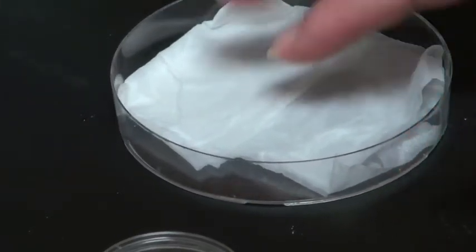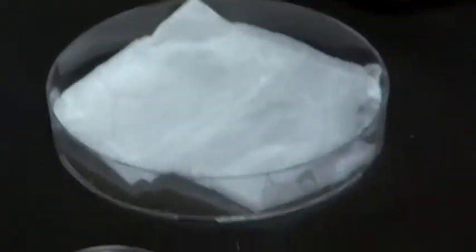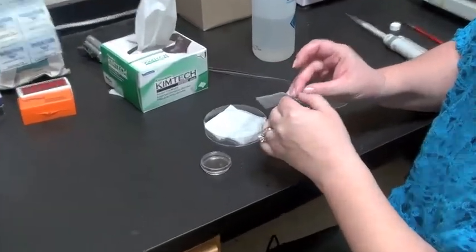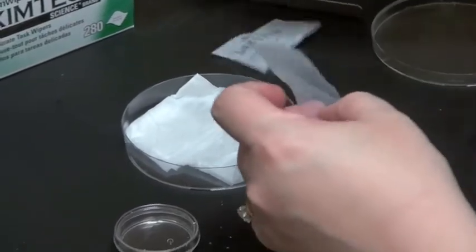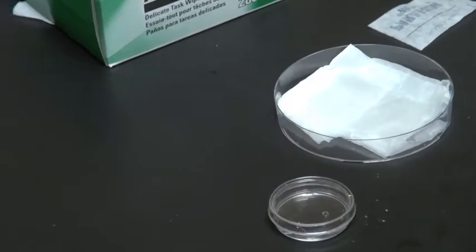To protect your slide from the wet paper towel, you're going to use a small piece of parafilm cut to fit inside the chamber but smaller than your wet paper towel or Kim wipe.